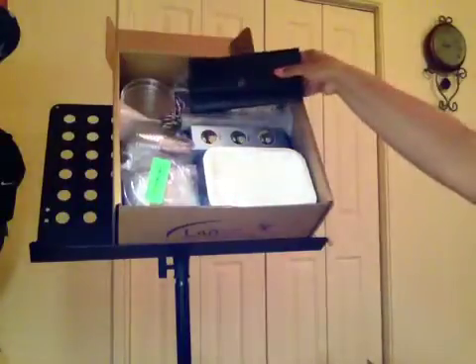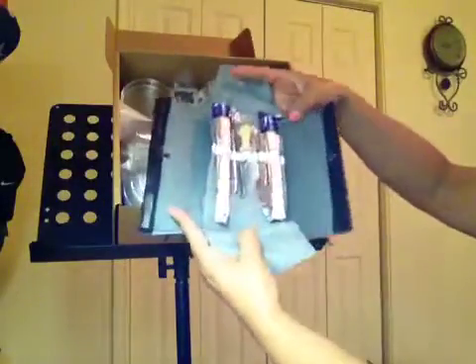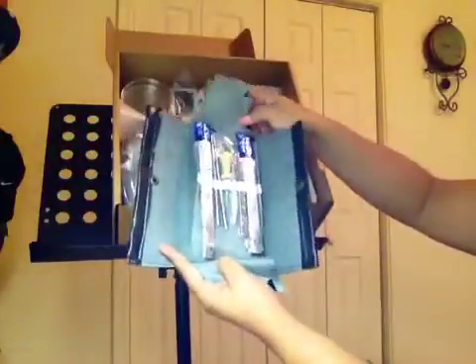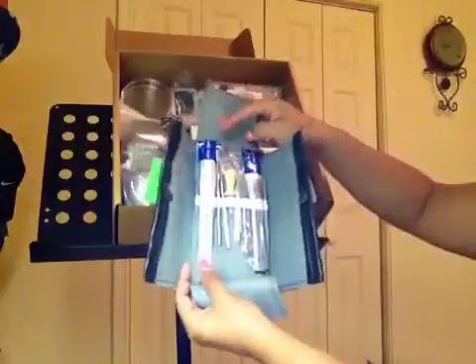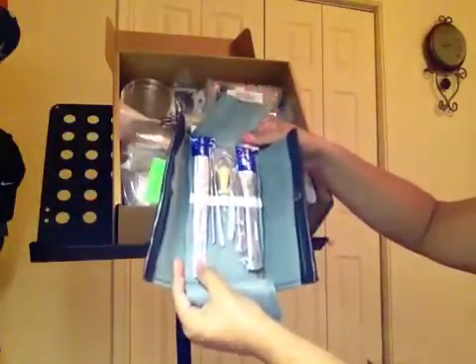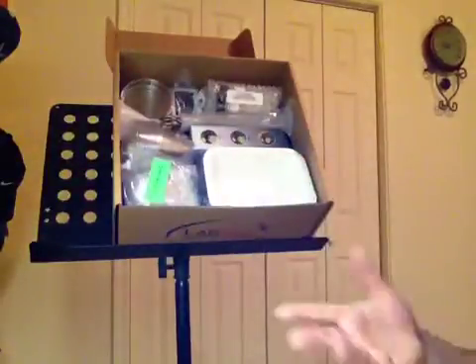Also in your kit you're going to see something that looks like a cosmetic bag — this is actually a dissecting kit. There are some really interesting looking, dangerous looking, and sharp instruments inside of your dissection kit. Everything packaged in here is sterile — these are all brand new, not recycled. However, please be aware that the instruments in here are real instruments. This is a real scalpel that's packaged in here, so if you have small children in your home, make sure this isn't something they can get a hold of. It's not a toy — it's scientific laboratory grade equipment.